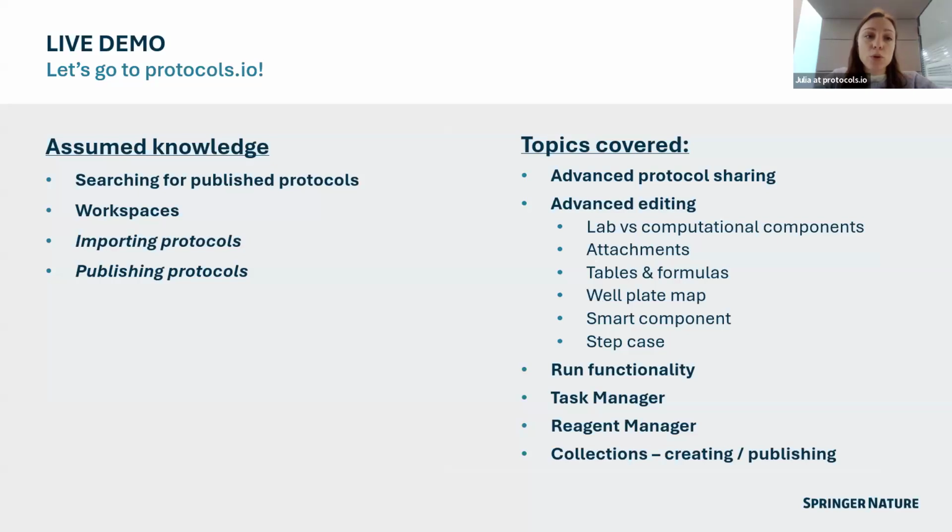All right, now I'm going to move out of the slides and into the platform. And because this is a more advanced session, I won't be covering some of the more basic things like searching for published protocols, the concept of workspaces and how they function, or the nitty-gritty details of importing and publishing protocols. But you can see there on the right what I will be covering. So let's go ahead and get started and jump into the platform.